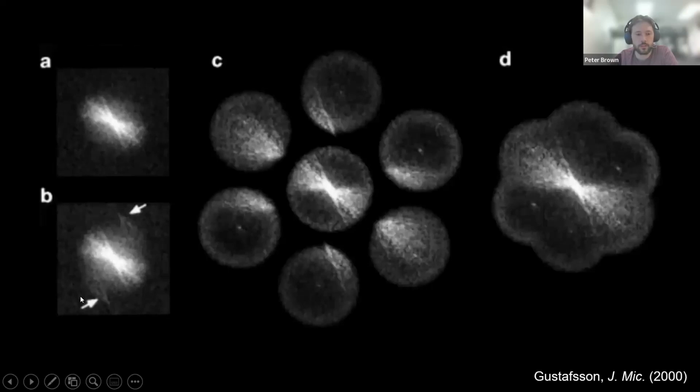You can see some of it here. If we unmix this information computationally, then we'll obtain these separated frequency bands that are shown in C. And finally, we need to combine all of this information to form our super resolution image.